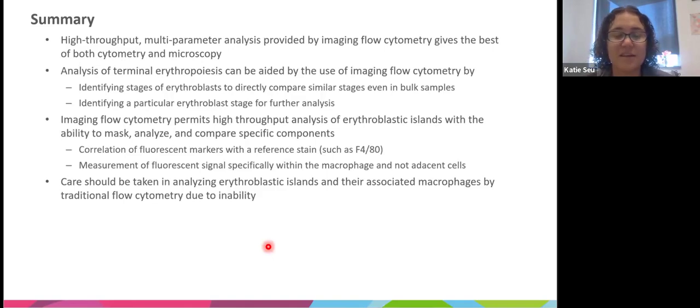And I think that this is really going to expand the applicability of imaging flow cytometry to different areas of research, as well as make it more accessible to researchers who maybe have a perfect test case for what it should be used for, but maybe don't know where to begin with the analysis or don't know what features to use to do their analysis. So the machine learning algorithm, I think, is really going to take this to the next level.